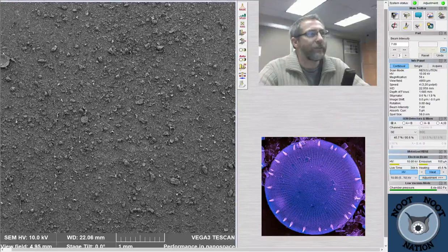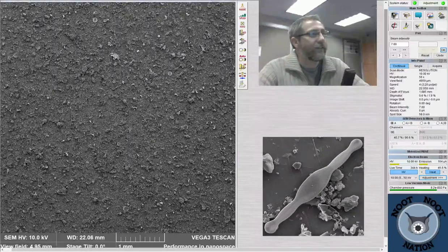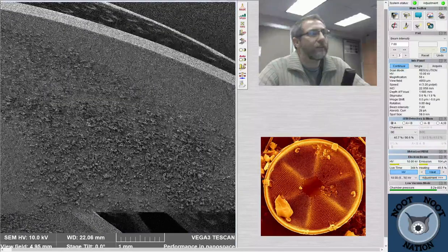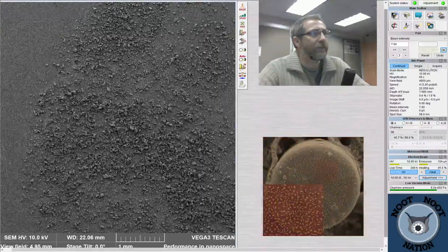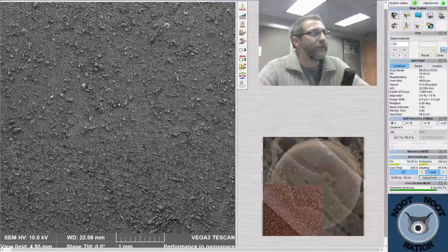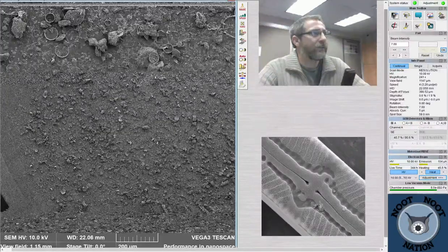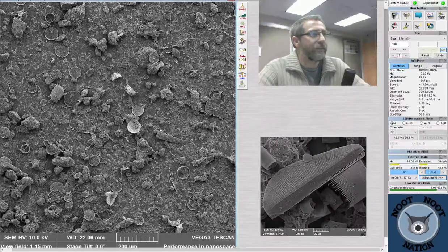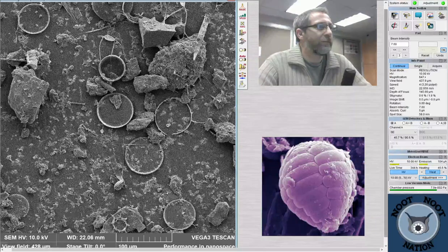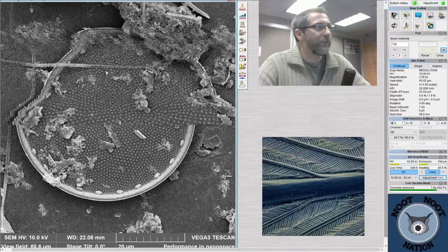I started processing these on Wednesday, and I put them in hot nitric acid. And then I came in early this morning and I did a bunch of rinses. So I'm just quickly skimming through them to see if any of them are a little bit better than any of the others with respect to quality. I have 4 of them, and I have a 5th one that was drying. They all have a little bit of clay on them, but it's not much. I did rinse them like 5 different times and still didn't get all of the organic matter and clay out of them. But what can you do? Except try your best.